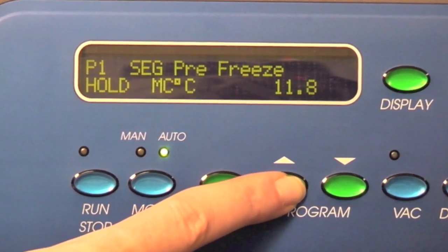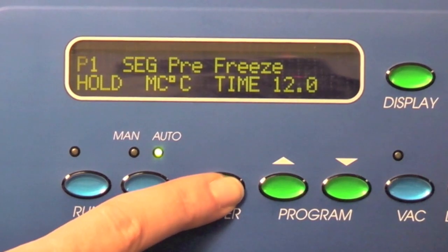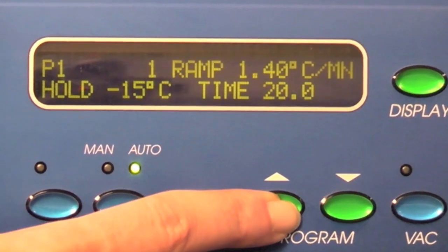Press enter again to store the parameter and advance the cursor until SEG is blinking. Use the up button to get to SEG 1.